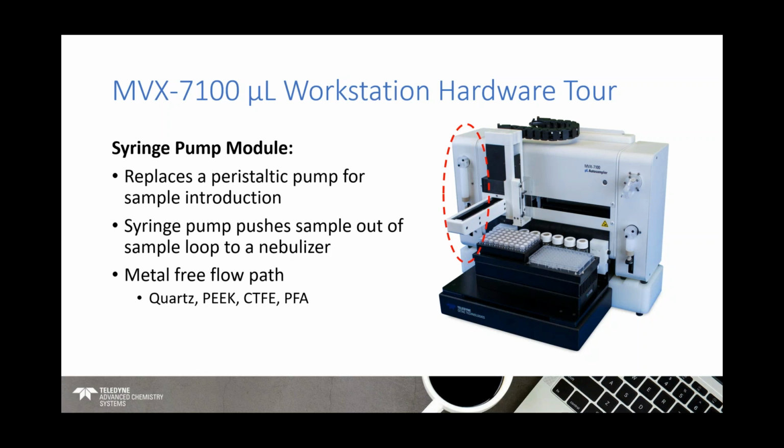So in this case, the materials you're looking at, the quartz is one of the options for the sample probe, the sample needle. In this case, all of the tubing from that module to the rest of the system is PEEK, CTFE, and PFA.